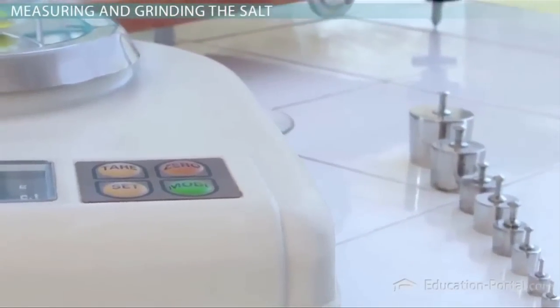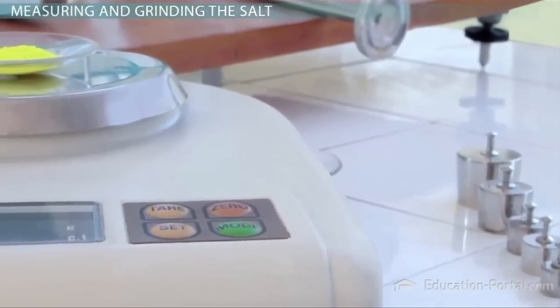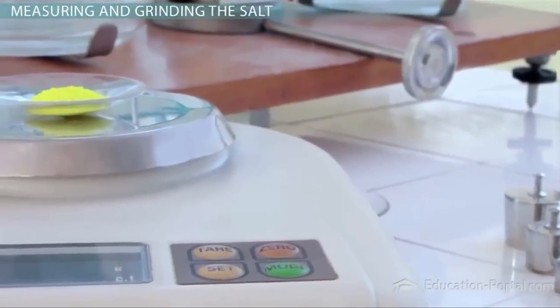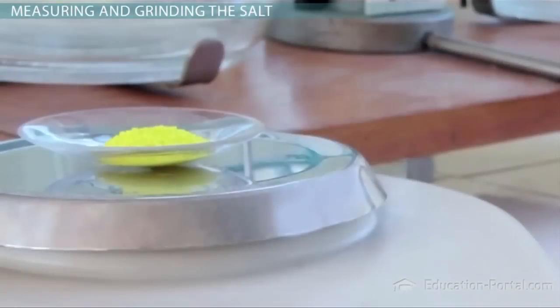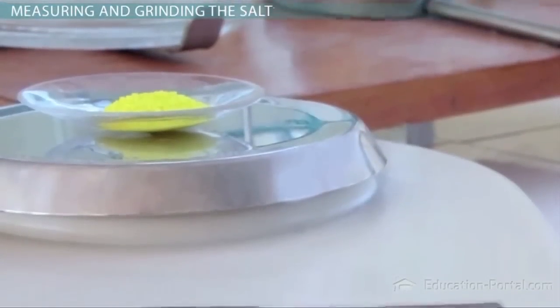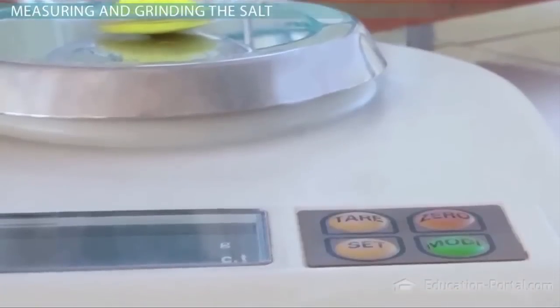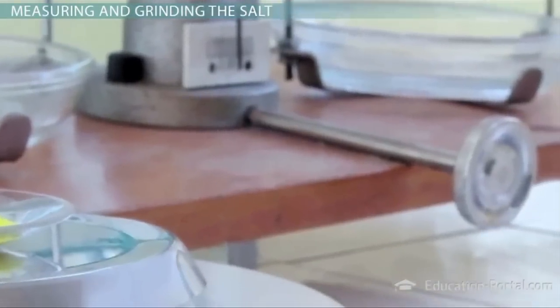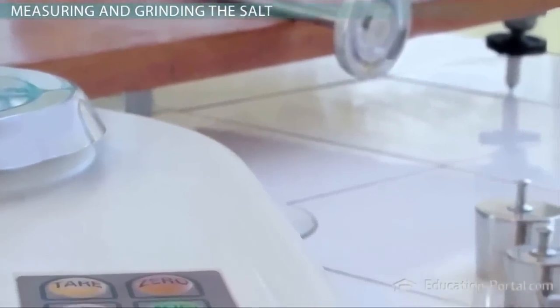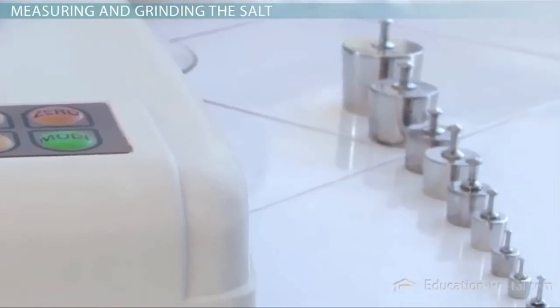Balances come in a large variety, and it is best to be sure you are measuring with one that has the precision necessary for the experiment. For example, if you have a small amount of powder you are measuring, you would probably want to use a balance that measures out to the nearest hundredth or thousandth of a gram. If you are measuring the mass of a large amount of a liquid, you may only need a balance that measures out to the nearest gram.